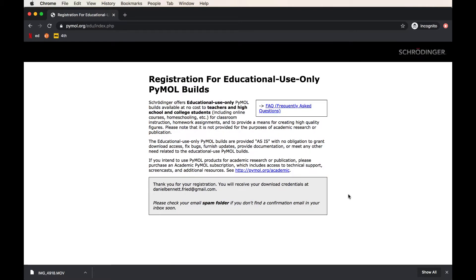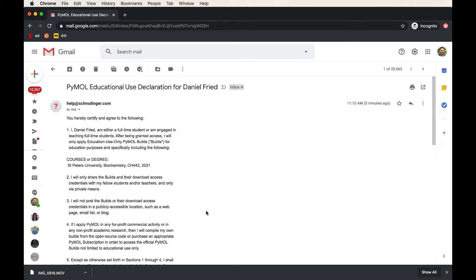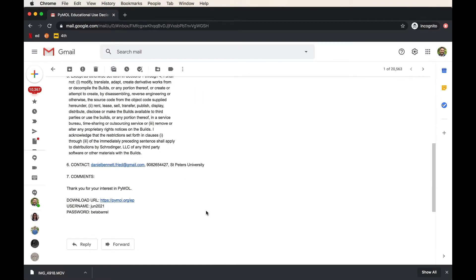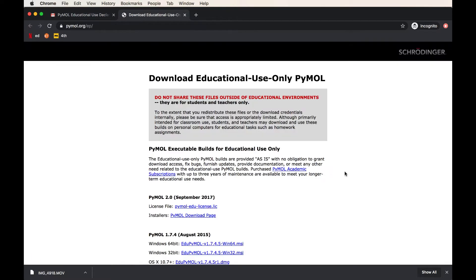You'll then be directed to this page, which has the licensing information. Just go ahead and fill in the code at the bottom and hit agree. And now you'll get your confirmation telling you that the download information has been emailed to your email address. In this email, you will see at the bottom the download URL and your username and password so that you can download PyMOL.